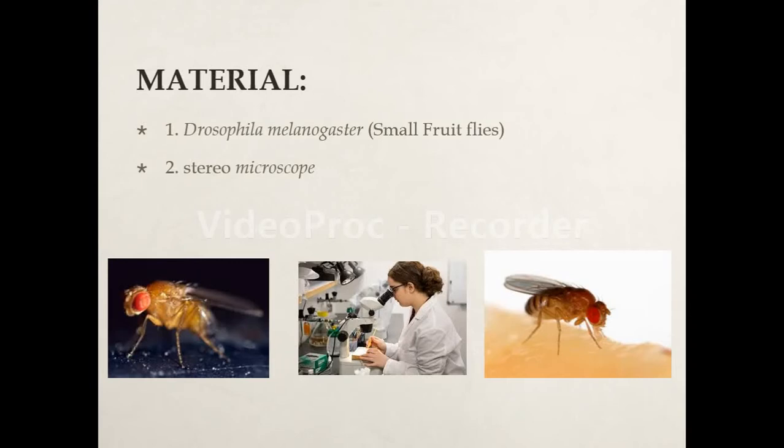In this situation, I will tell you about the study of Drosophila. I mean to say how we study the genetic structure of the Drosophila fly, and what the procedure is for studying this fly. How we prepare the Drosophila fly so that it becomes easy to study the genetic structures, its sexes and transmission, how traits transfer from parents to offspring. What are the procedures involved in transferring the traits, and how we prepare the Drosophila fly for studying the genetic structure.